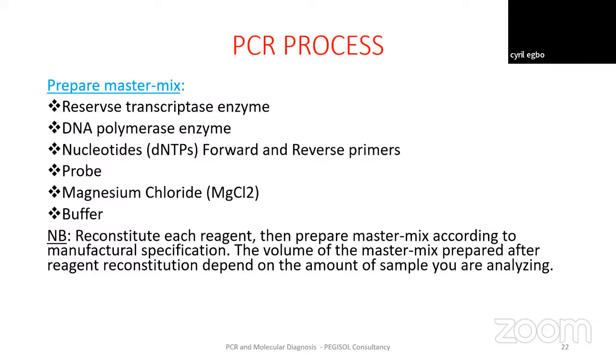By the time you now culture that sample, what that culture helps to do is to amplify the number of the bacterial load in that particular sample.